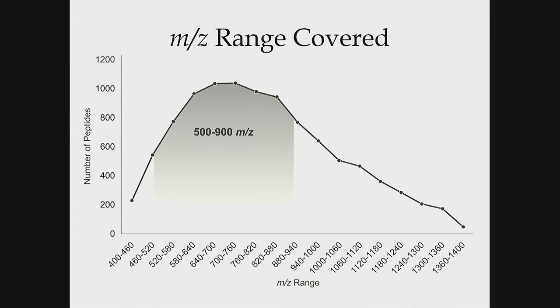And then the plot on the y-axis is the number of peptides from each of these runs. What I'm trying to show, as people have brought up before, is that the mass to charge range has an uneven, non-uniform distribution of information of where peptides are. So when we're considering what mass to charge range we want to cover to be able to assess the most peptides and therefore assess the most proteins, it makes sense to focus in on the dense region. So this is kind of a plot of that density.